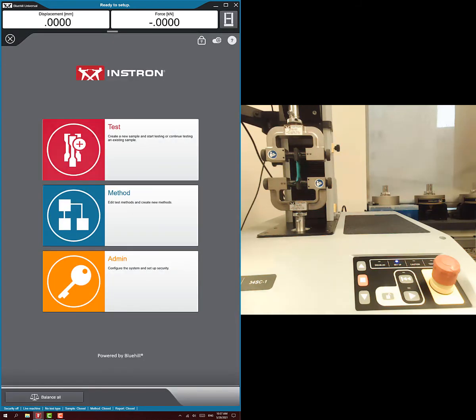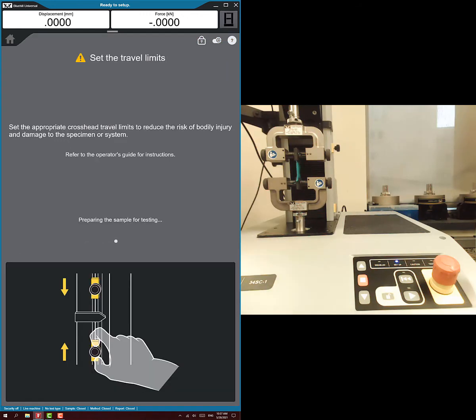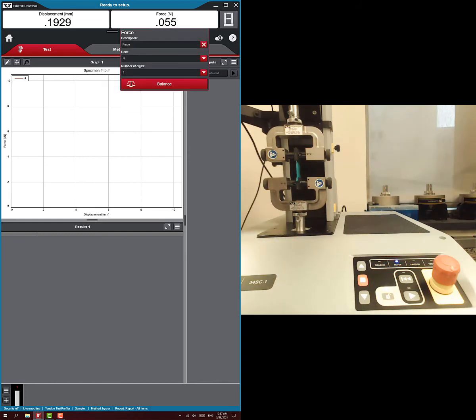Now we're ready to run our test. Here's my weird spelling of hysteresis test. It's going to tell us to make sure the crosshead is set up correctly, which it is. I've already hit setup, so I hit unlock and it's in the setup. I'm just going to make sure I've pulled it just a little bit so it's ready to start testing, then I'll zero out our values and I'm ready to run the test.